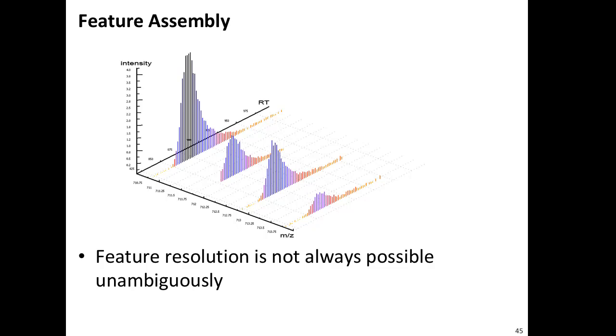There are multiple explanations for something like this. You could have sulfur. Remember what I told you about sulfur yesterday, that you have a mass difference of +2? So this is a typical case that we have for sulfur, which is why sulfur peptides are tested independently in this algorithm.